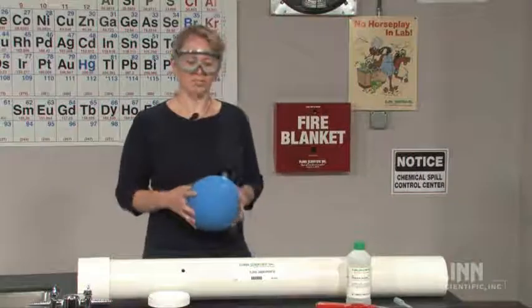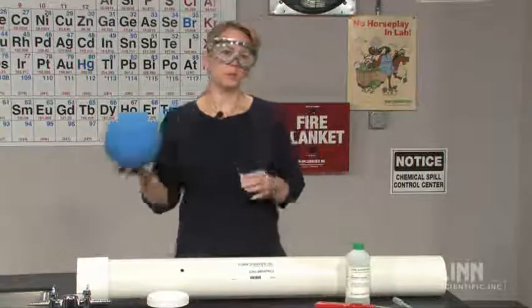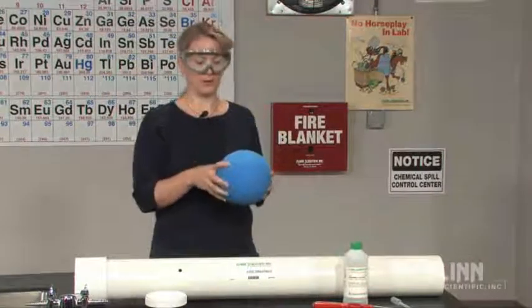Launch into a discussion of chemical reactions using the fun and exciting alcohol cannon. This ball will be propelled across the room using the combustion of isopropyl alcohol.